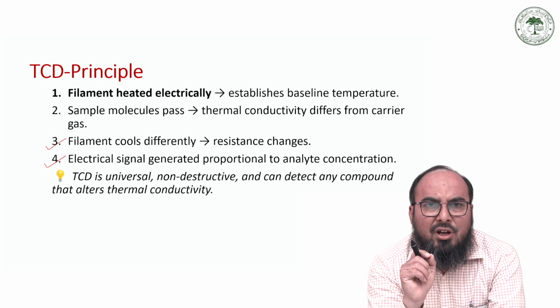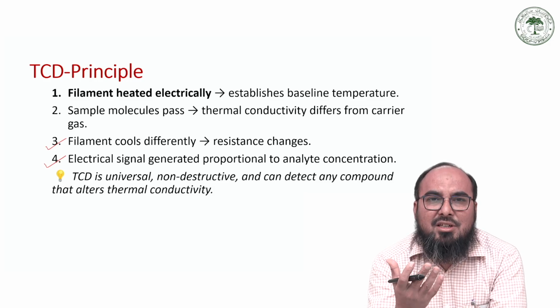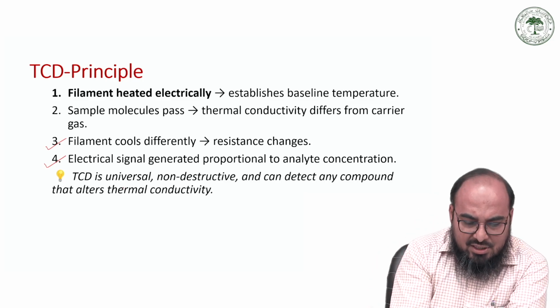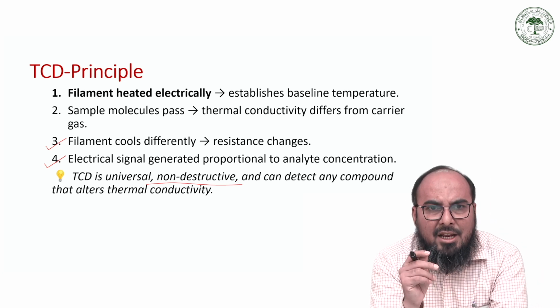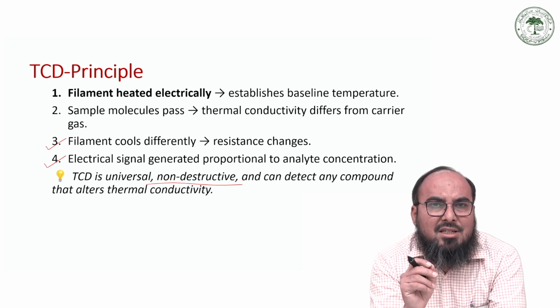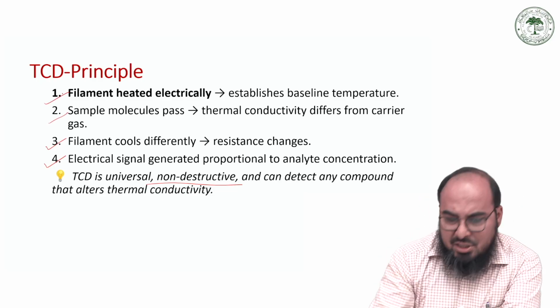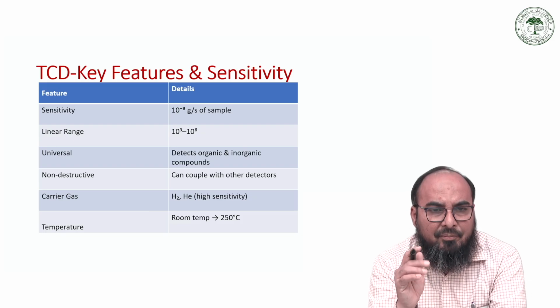The beauty of this TCD is that it is non-destructive. Your sample does not get combusted or mixed with anything, so you get the sample back. This is the beauty, that it is non-destructive and it can detect any compound that changes its thermal conductivity, because the basic underlying principle is the thermal conductivity. So let us see the different features of it.